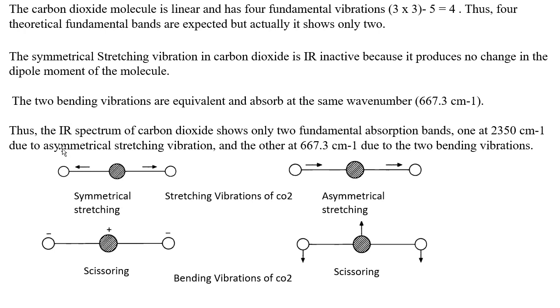What is the reason? The symmetrical stretching vibration in carbon dioxide is IR inactive. In the symmetrical stretching, the dark or shaded ball is carbon and the unshaded balls are oxygens. Then you can see it is symmetrical stretching. Both sides have the same atom, oxygen and oxygen.